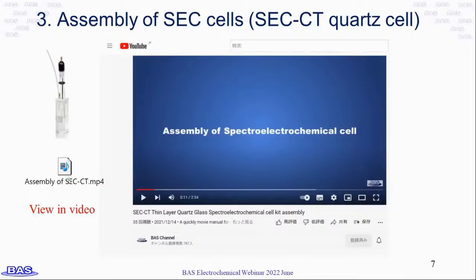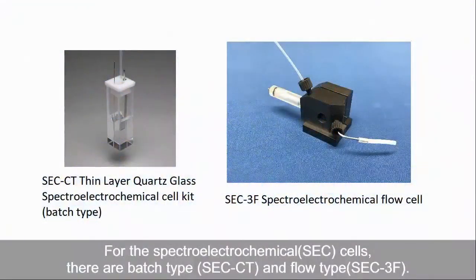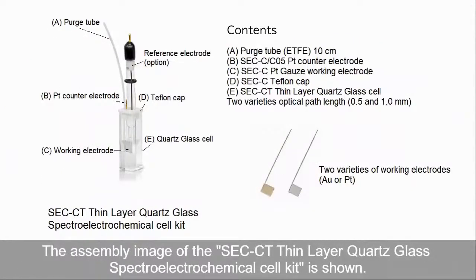Next, I will show you how to assemble the SECCT quartz cell by video. You can also watch the video on our BAS channel. For the spectroelectrochemical cells, there are batch type SECCT and flow type SEC3F. In this video, we will introduce how to assemble the SECCT thin layer quartz glass spectroelectrochemical cell kit. The assembly image of the SECCT thin layer quartz glass spectroelectrochemical cell kit is shown. Here are the details of the components.